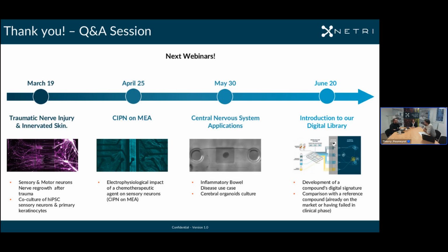It's PDMS, so I would imagine you can cut it. Except for the MEA, not for the MEA plate. I would say the NeuroFluidics. So I don't think we have done it. We mainly did cellular analysis and didn't look into histology and cutting the chip. With the material that we have, I think it would not be an issue, either with different ways of embedding with resin. I don't think the PDMS is not tough enough, and it would be feasible to cut it later on.